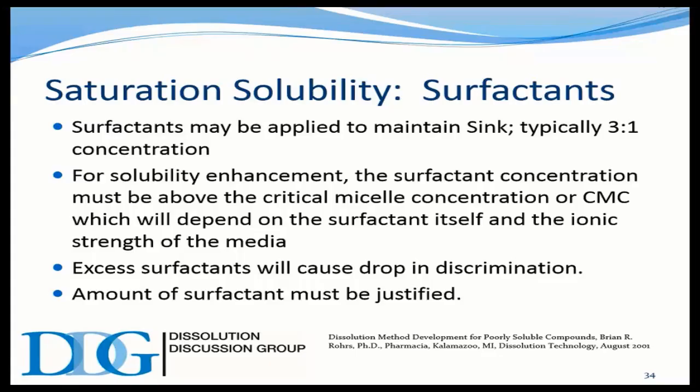So in other words, if 0.2% sodium lauryl sulfate will do the trick, and we throw in 0.5% or more, we may actually cause the release to be fast enough where we lose discrimination, or the ability to tell a good batch from a bad one. It's overriding the effect of looking at the true product going into solution, but forcing it to be faster, which will not allow us to have the discrimination that we should have in our test.